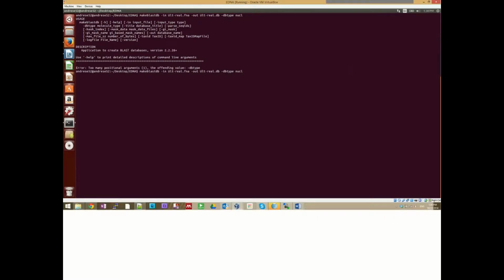So let me know if you're having the same error. I just ran it previously and it worked perfectly, but I was showing some error.